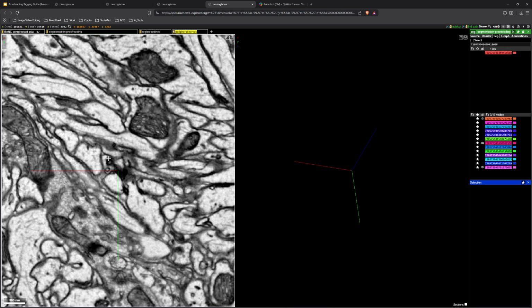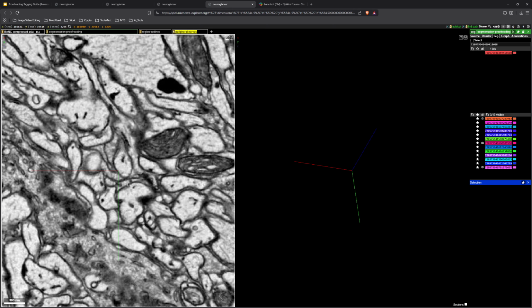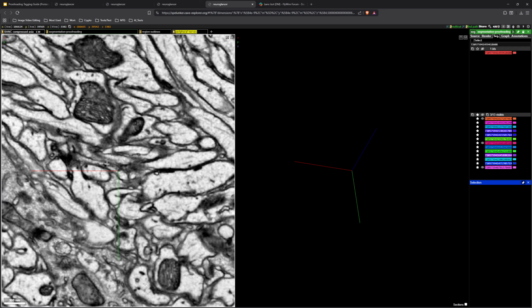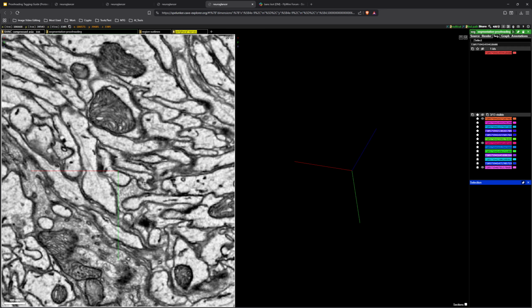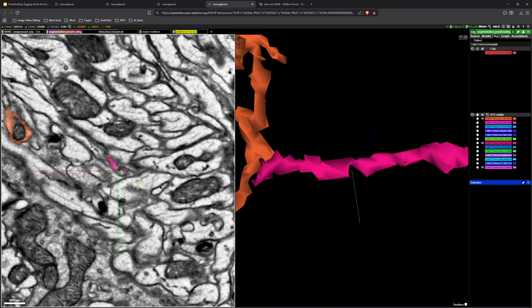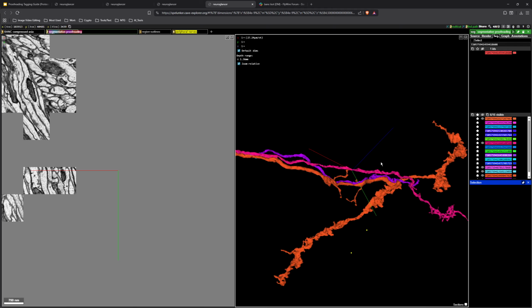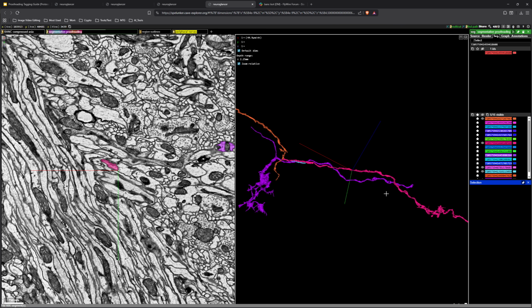And if we follow the ER, it goes down here, like how we were checking, but also there's this part. So I started to check that, and it indeed still has the ER in it. So that is a good indication that it continues for quite a while. And with these other cells here, we can see more cells.